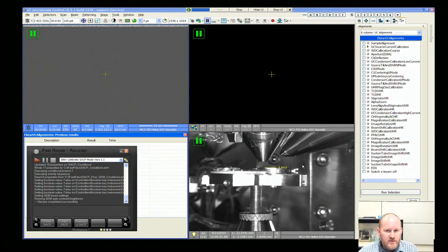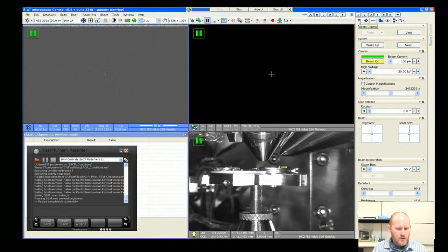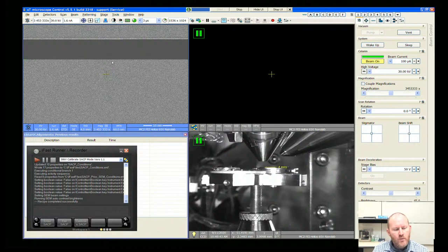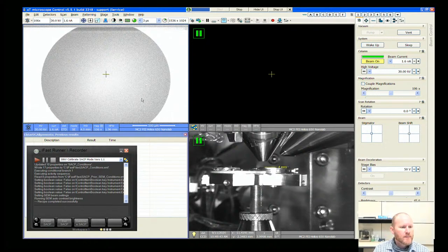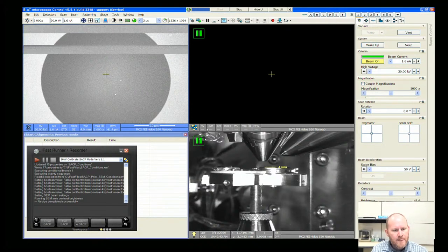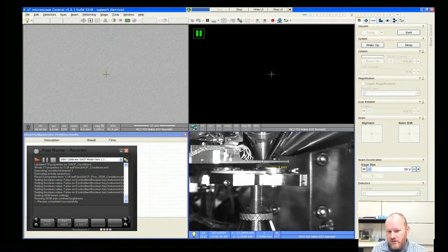Hopefully you can see my Helios screen. What we've got right now is a number of silicon wafers inside — these are single crystals because they're the easiest to get a pattern on. This is an Everhart-Thornley image, so standard secondary electron. We will use the backscatter detector for the SACP collection.